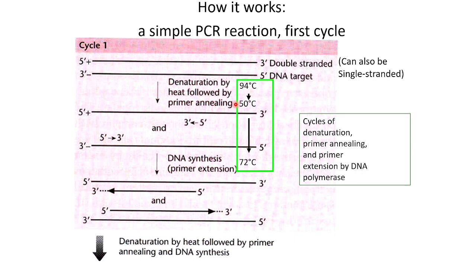After you have mixed all of these ingredients very gently, in the end you add some amount of your enzyme, which will actually perform, and then the entire mixture is put in the thermal cycler. First it will start denaturing at a higher temperature, and then the annealing occurs. This annealing temperature depends on the melting temperature of the two primers.